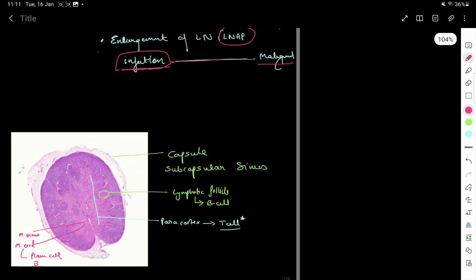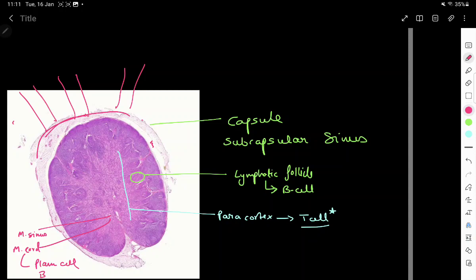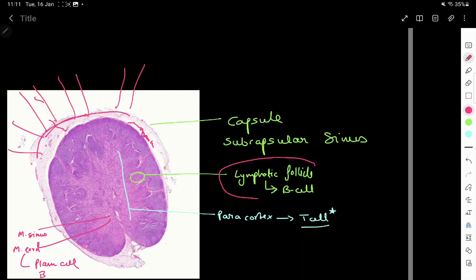Here we see a bean-shaped organ that has a capsule, and beneath the capsule we can see the subcapsular sinus. The lymph node has multiple afferent channels which bring lymph, and this lymph collects in the subcapsular sinus beneath the capsule. Beneath the subcapsular sinus we have the cortex of the lymph node, and the cortex is filled with lymphatic follicles.